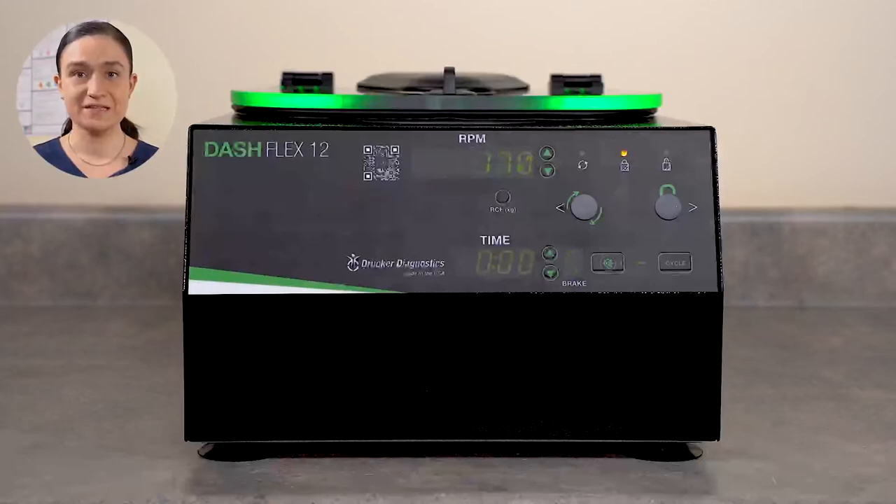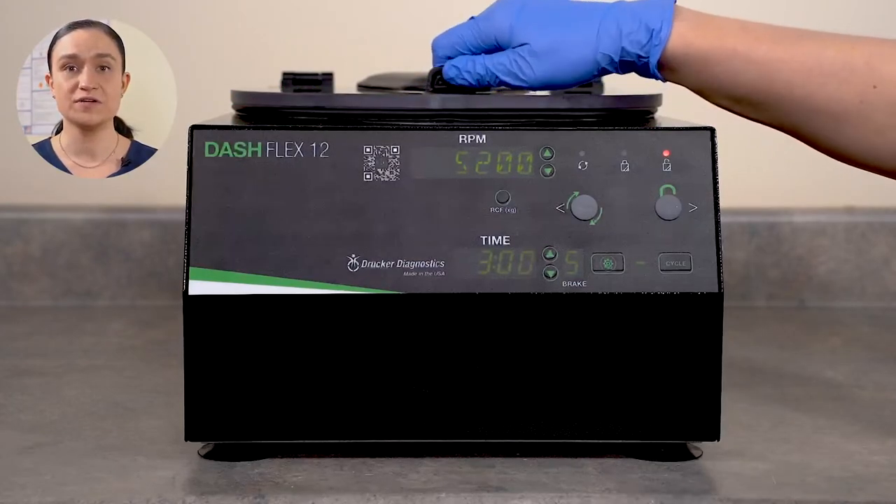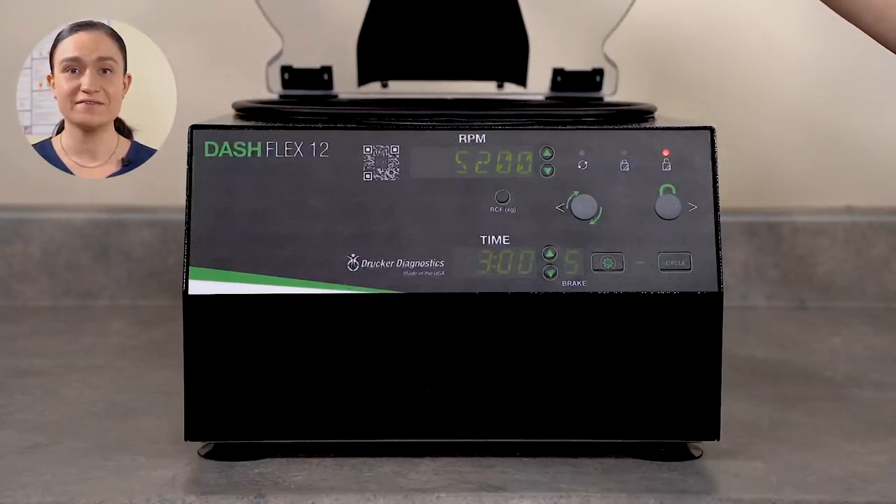Once the run is complete, the centrifuge will begin to slow down, applying the rotor brake at the level you selected. When the rotor is fully stopped, the centrifuge will beep and the lid lights will flash to let you know it's done. The centrifuge will automatically unlock. Turn the lid latch a quarter turn counterclockwise and then lift the lid to retrieve your spun samples. And that's all there is to it — you just ran your first cycle.